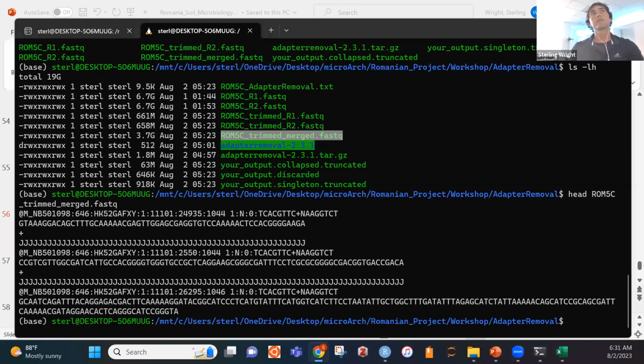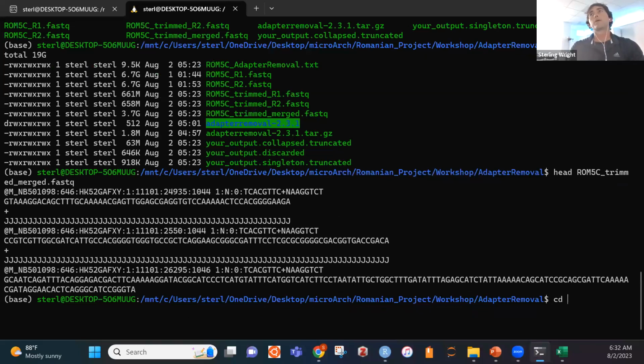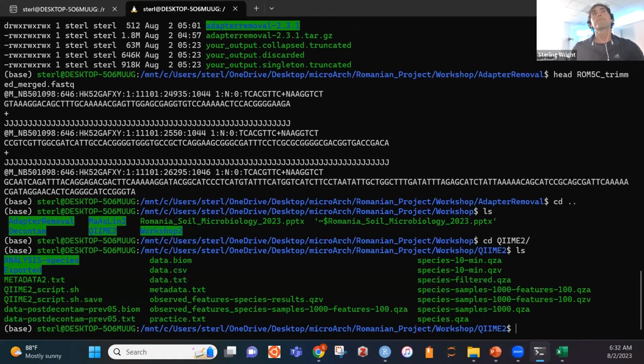So I'm going to go back to Linux. All right. I am going to go into the QIIME2 directory.